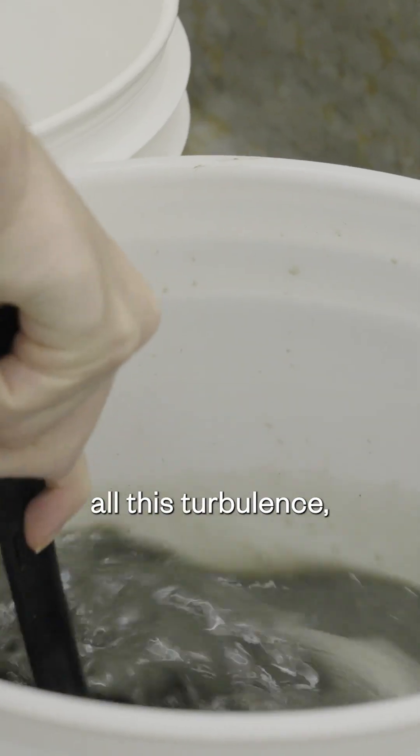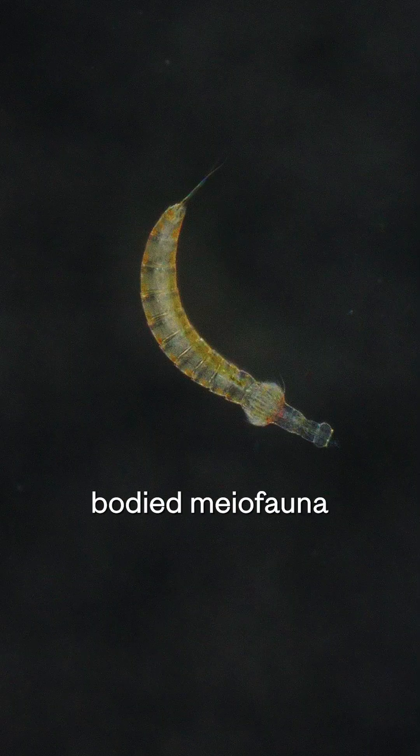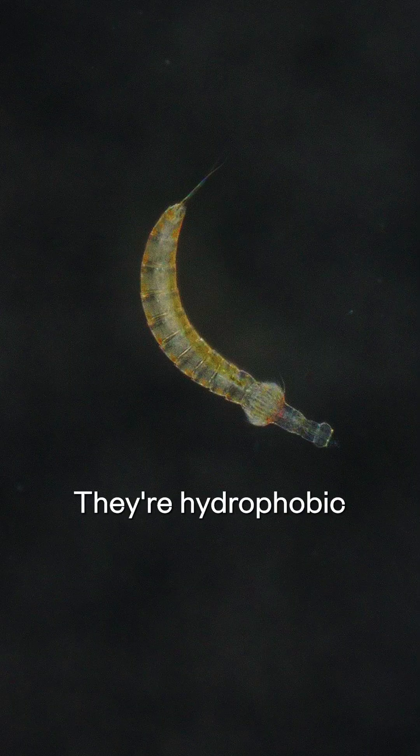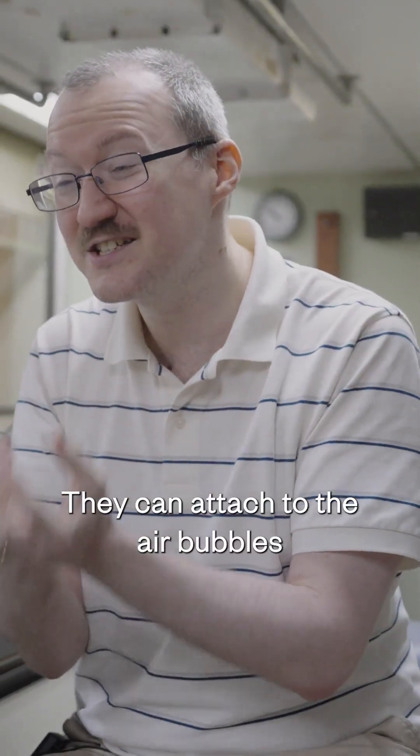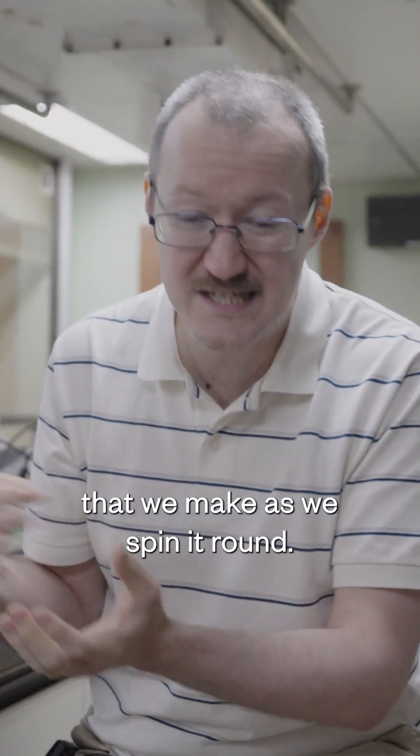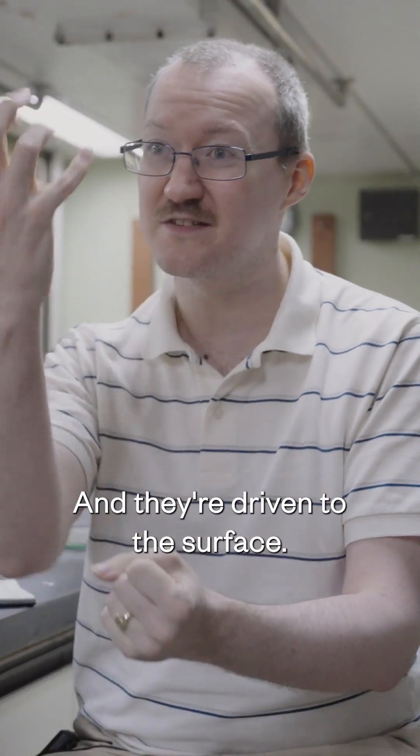As we cause all this turbulence, the cuticles of the hard-bodied meiofauna are hydrophobic. They actually don't like water very much. They can attach to the air bubbles that we make as we spin it round, and they're driven to the surface.